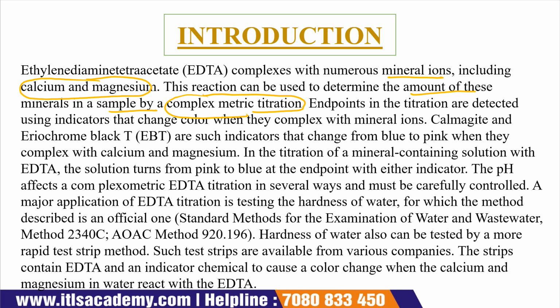Endpoints in a titration are detected using an indicator that changes color when it complexes with mineral ions.